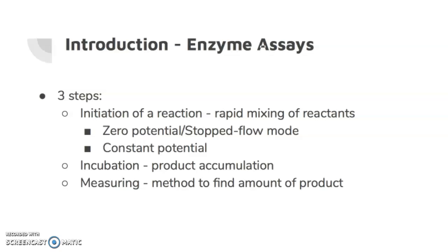Mixing of the reactants and incubation can occur in one of 2 ways. The first way is known as the zero potential or stopped flow method. At zero potential, the product would accumulate in a single mixing zone because the electrokinetic and electrophoretic transport would not occur. This corresponds to a fixed time reaction in a conventional enzyme assay.